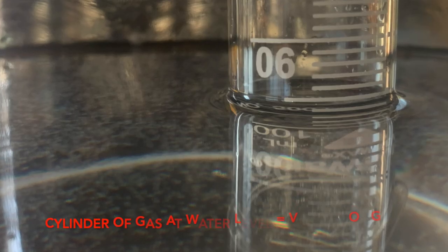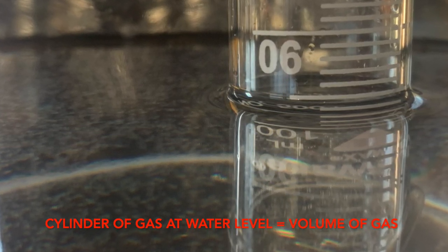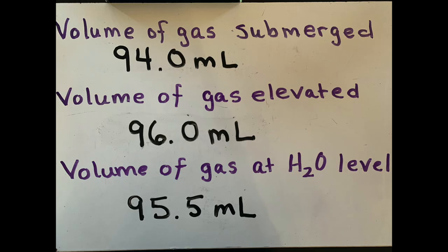So what you need to do is have the grad cylinder at the water level inside your water basin so that it matches the atmospheric pressure of the day, so we can use Dalton's law to calculate the pressure of our gas that we collected. The pressure of the day was 767.6 millimeters of mercury.